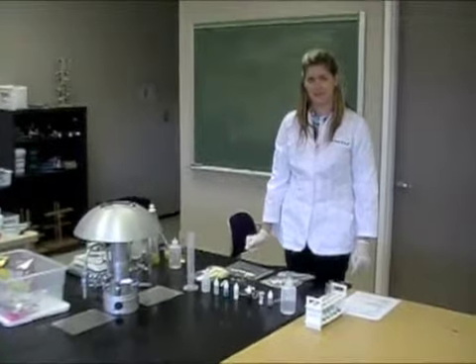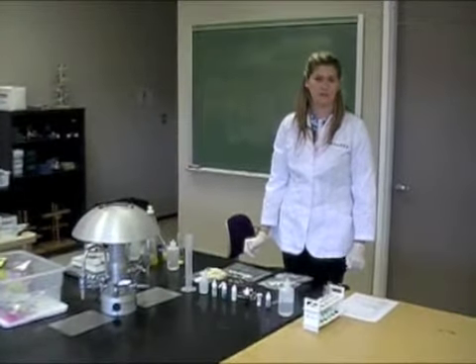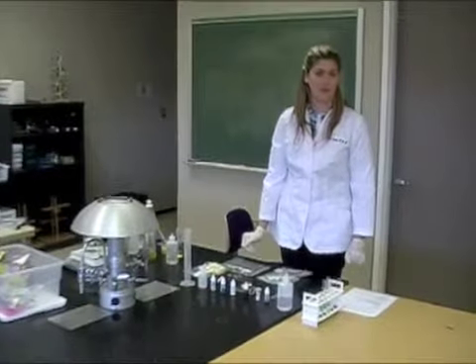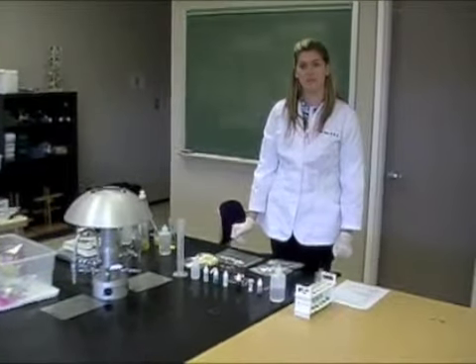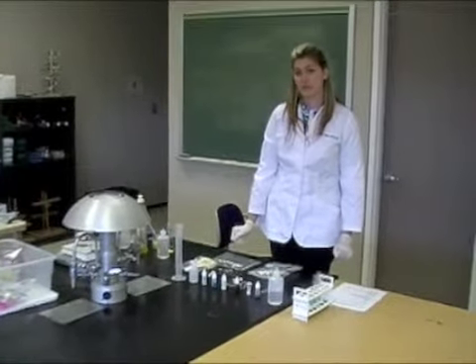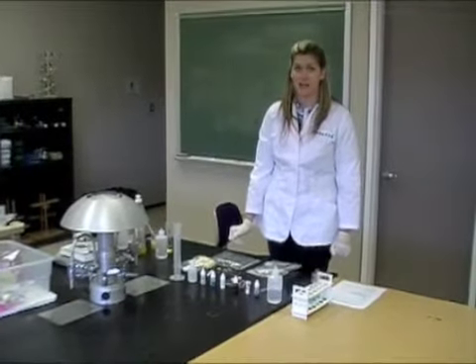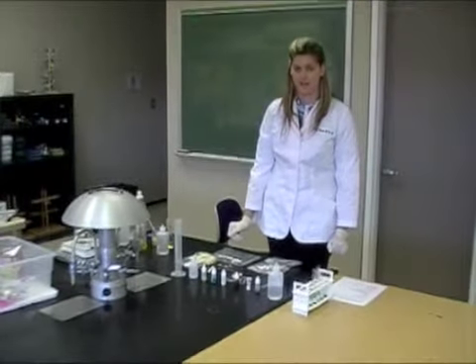Here we go. I'm first going to introduce you to the objects that you have in your lab kit that you will be using for intro to chemistry lab, and also the objects that you should purchase at home or have in your household cabinets.